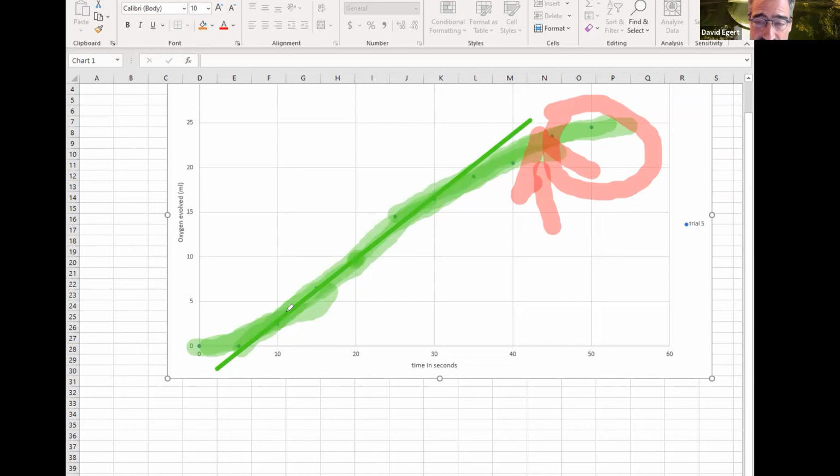Because ideally, we'd have finer little bubbles rather than big gloopy bubbles. And we've been trying to play with that a little bit, but we didn't do it really this time. So I don't know if that makes it clearer.